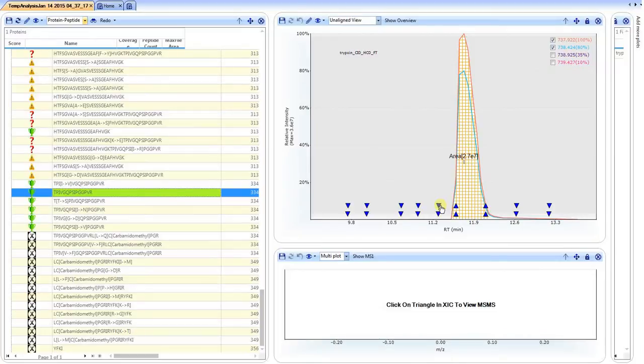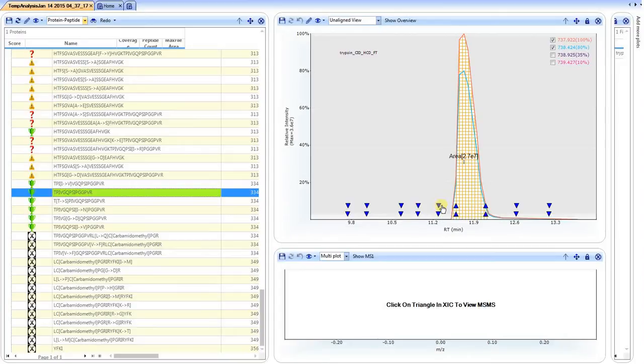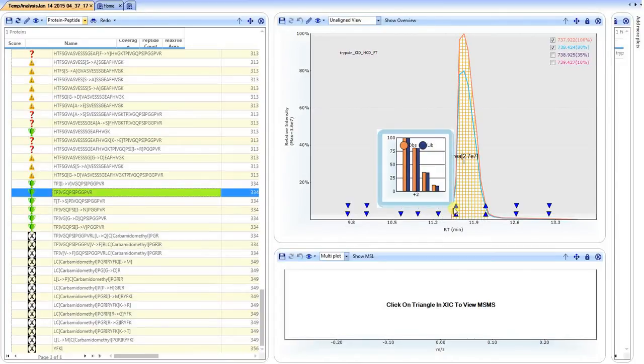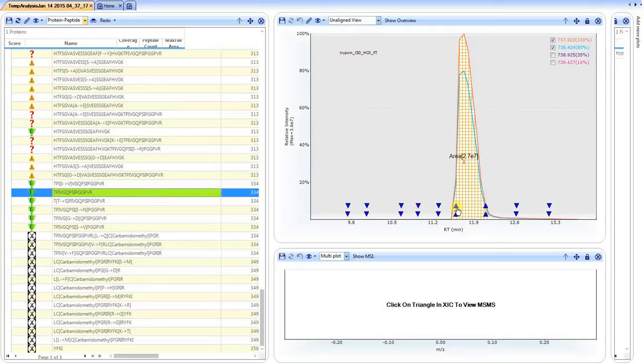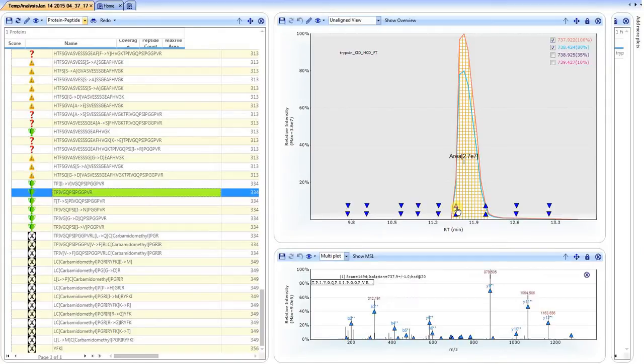The down arrows represent poor matching of the expected MS2. Up triangles represent a good match. If we hover over a specific triangle, it simply tells you that the MS2 represents the plus two charge state and the fragmentation mode is HCD. If we click on this, the product ion spectrum shows up below with the annotated peaks.